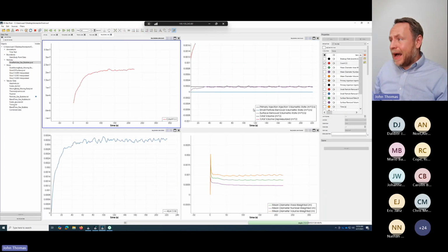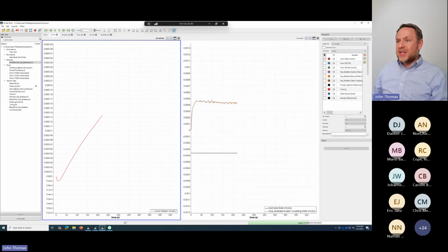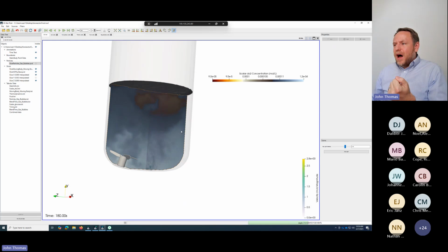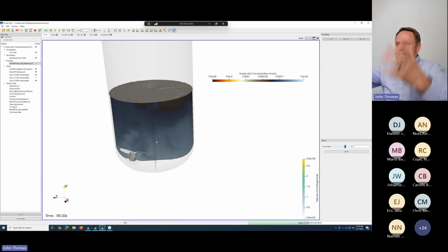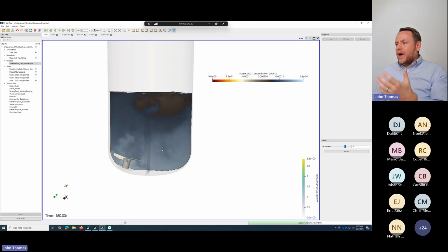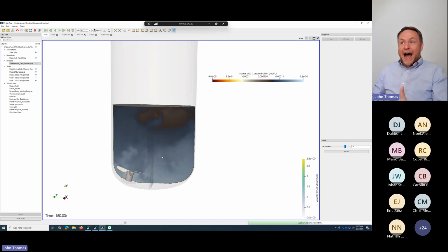And even when I get to a bounce here, even as these guys bounce, once DL converges, this gradient will persist. But look at what I can see here. I can model this like a multi-phase gas cell system. I put the free surface on here with this ongoing reaction to see where the oxygen isn't. And that's how you build a bioreactor model.